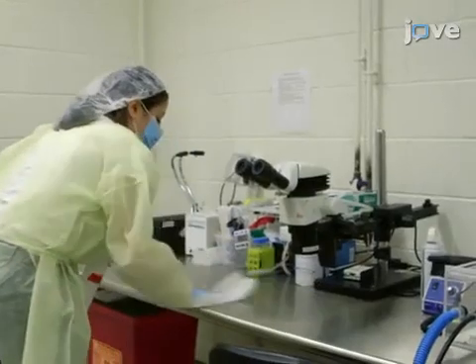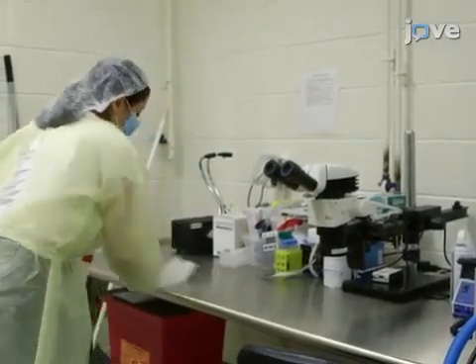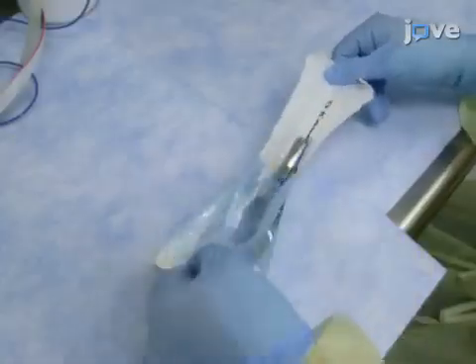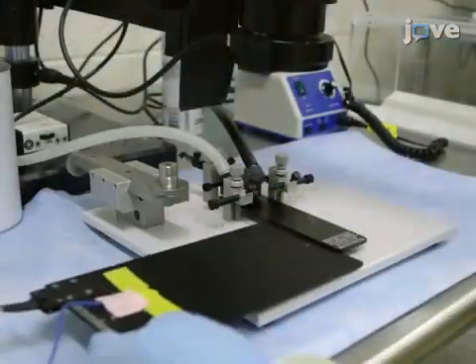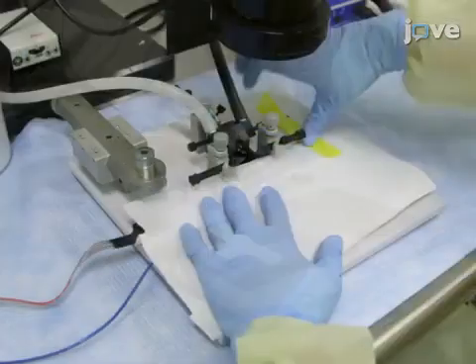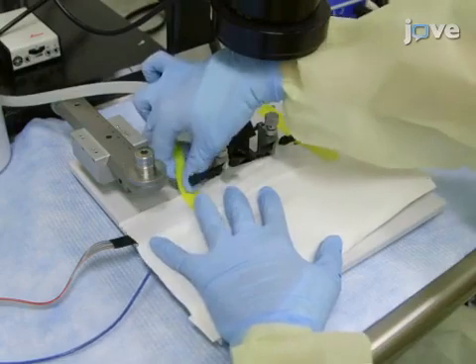To begin this procedure, disinfect the surgical table with 70% ethanol. Then, cover the entire surgical bench with absorbent pads and arrange the surgical instruments on the surgery table. Next, set up the stereotaxic equipment without the manipulator arm. Place the heating pad on the stereotaxic frame and set it to 37 degrees Celsius. Avoid overheating the animal by placing a small piece of paper towel or surgical pad on the heating pad.